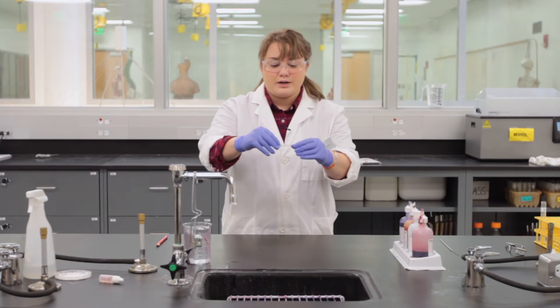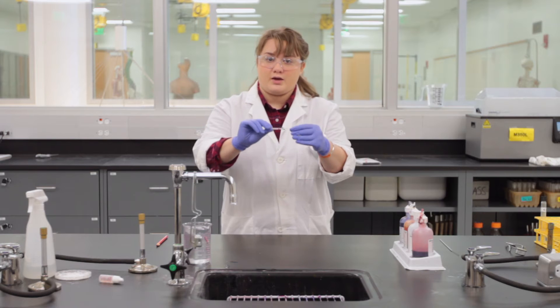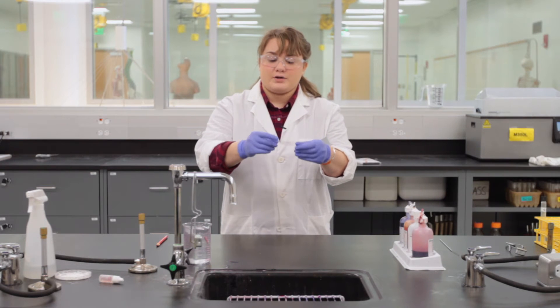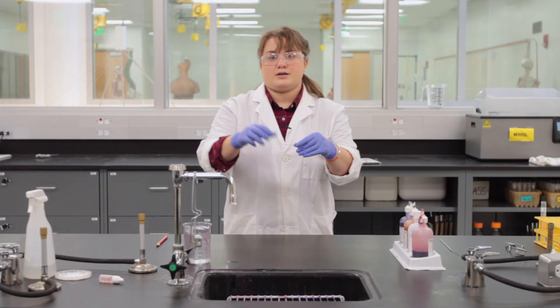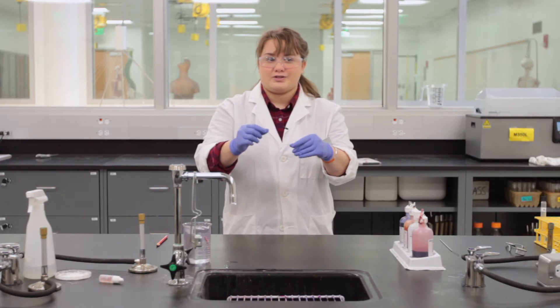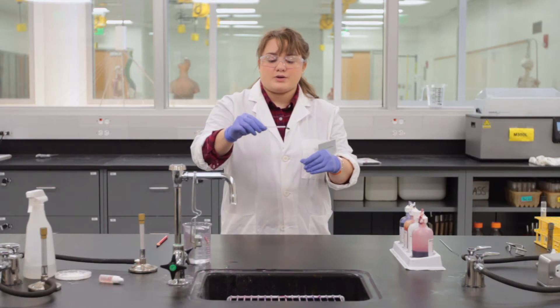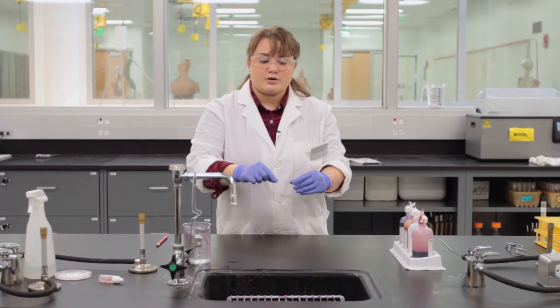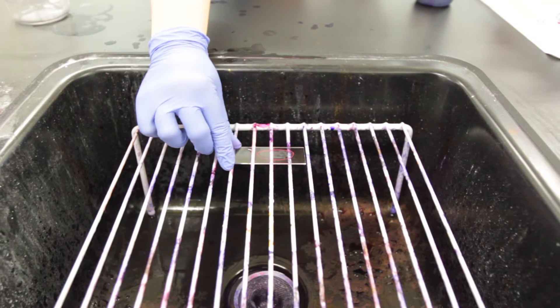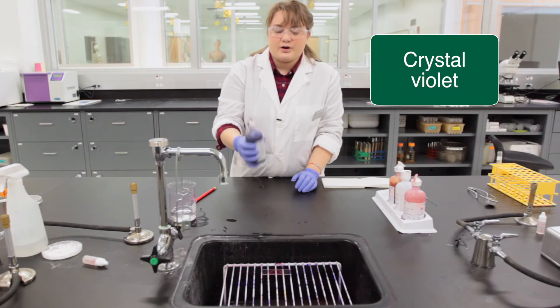On your slide you should have drawn a red circle and flipped it over and put the smear on the circled portion so that you can differentiate which side has been used. Take this slide and place it on the wire rack in the sink, and we're gonna start with our crystal violet.